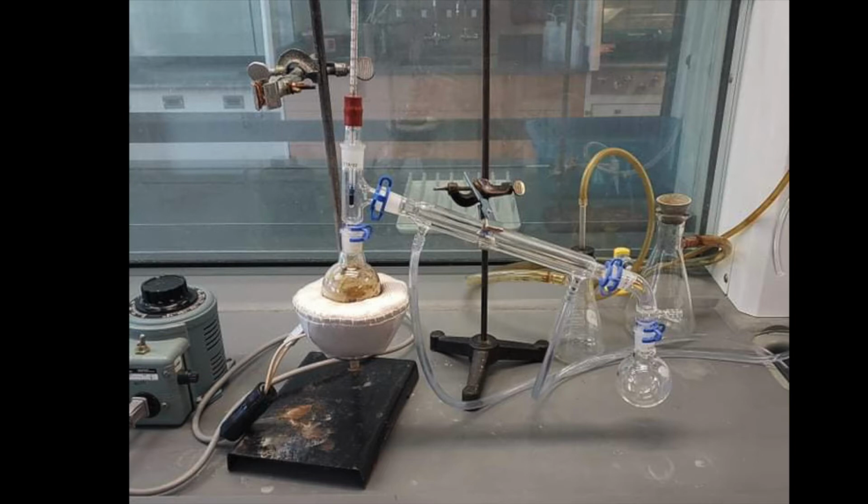Notice that at each glass junction is a blue clamp to hold the glassware secure. Before you begin heating, please have your instructor check your apparatus to make sure that it is set up correctly. A photo of your setup might be a nice addition to your lab notebook. Once your instructor has checked your apparatus, you can begin heating.